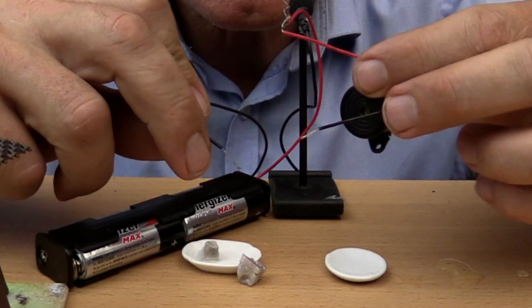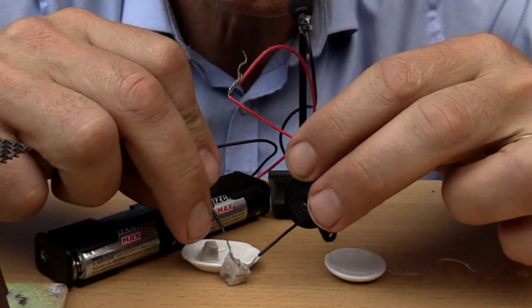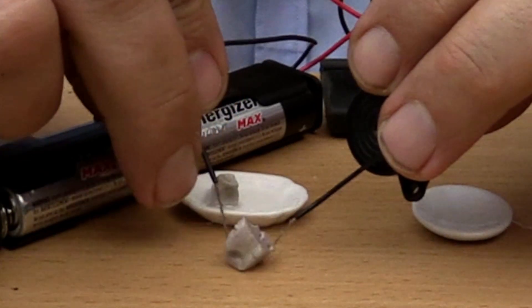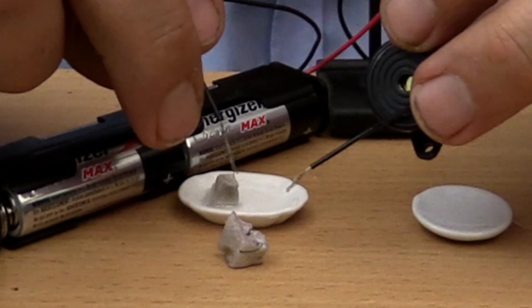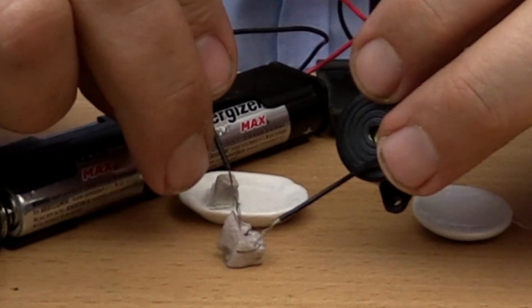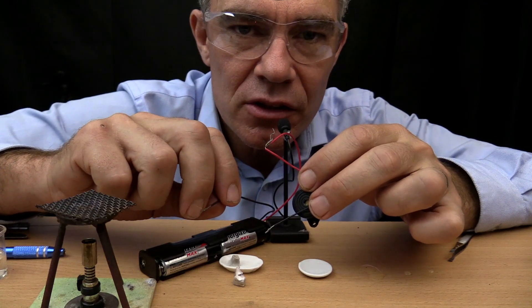If the buzzer sounds, it means it conducts electricity. Only the surface that has been freshly cut conducts the electricity. Metals are good conductors of electricity.